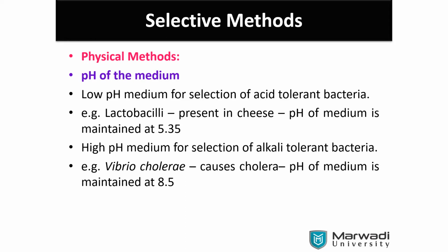So now how to dissolve the salts? If you go for rotten organic matter, it cannot be done because of the pH condition. So step by step, we have to prepare the synthetic media so that the pH is maintained. The salts are going to remain as such. Then we need to go for different combinations.